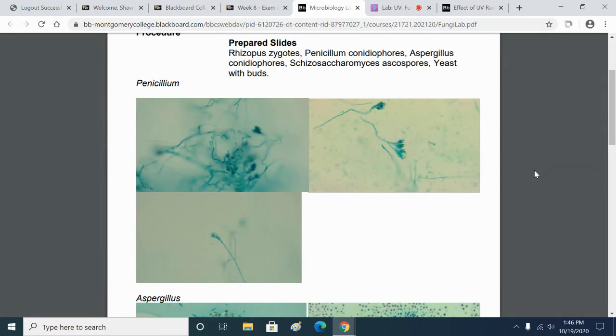That is also Penicillium. If you examine the green part microscopically, what you see are these structures here, called conidiophores. They look kind of like the end of a broom or maybe like a skeleton hand that's kind of knobby. And it does have little round dots on it, and those are spores. We're going to talk about fungi in lecture on Wednesday, just a little short lecture.